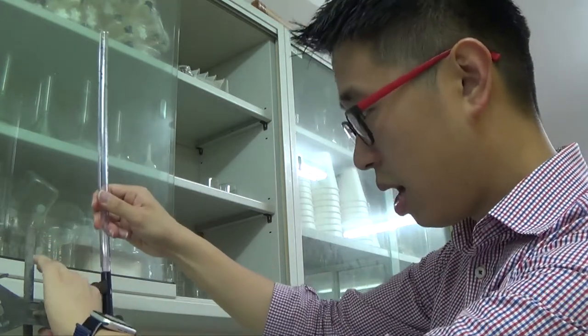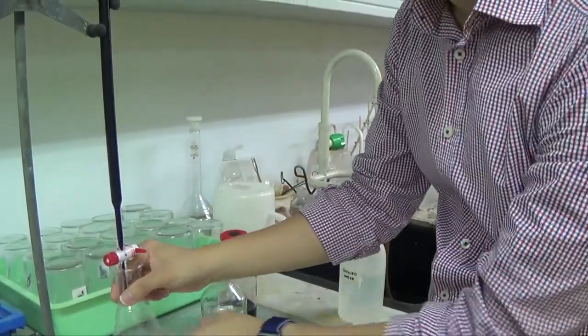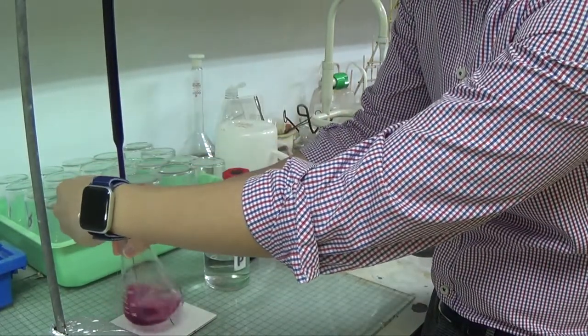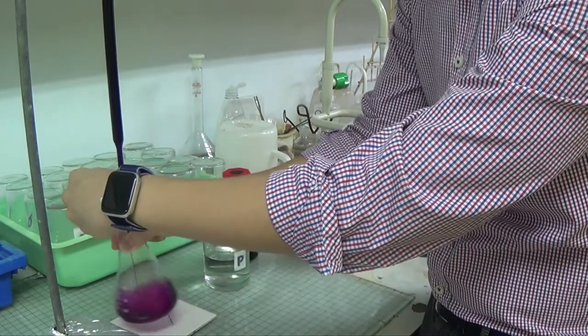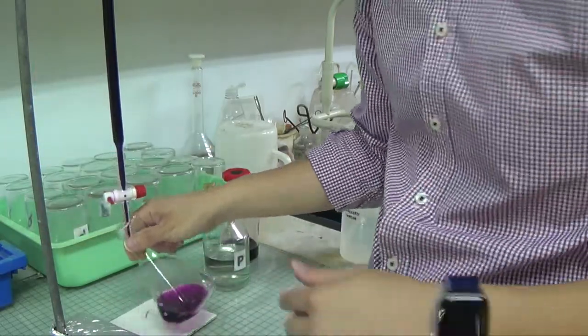So now I just want to show you what happens if I have added a huge excess. This was slightly pink already. If I add a lot more, I hope you can see the color gets more and more intense, because now you have a huge excess of the KMnO4.